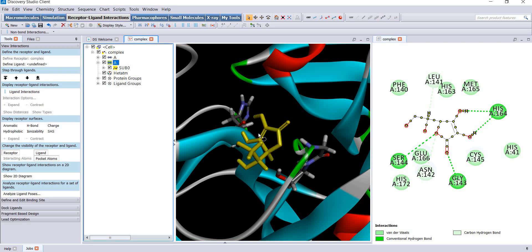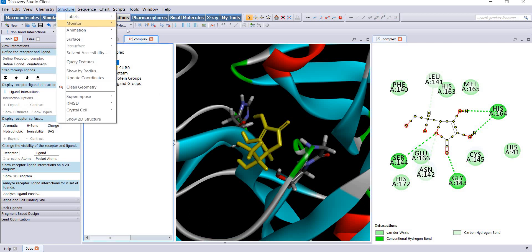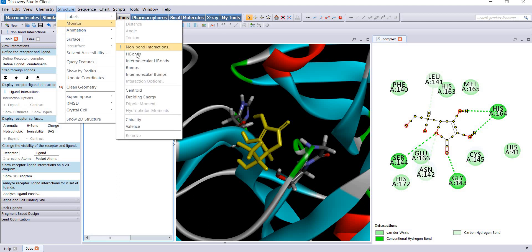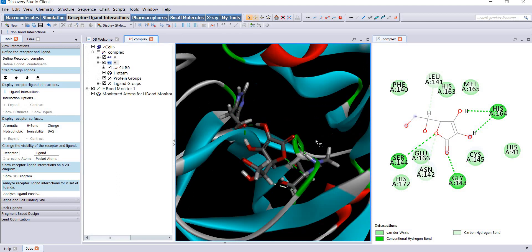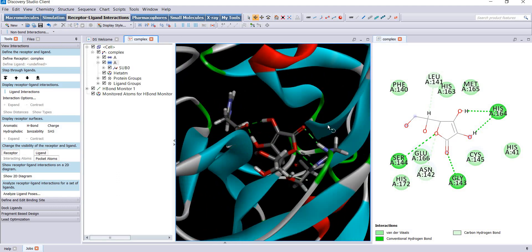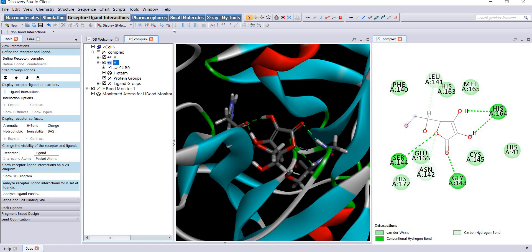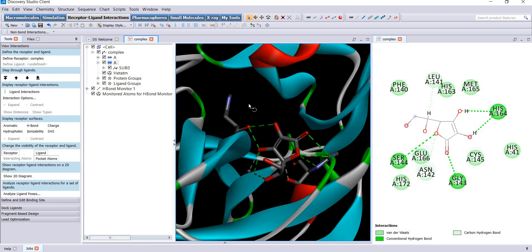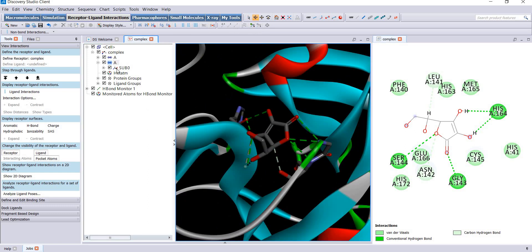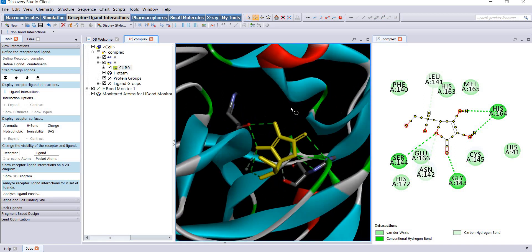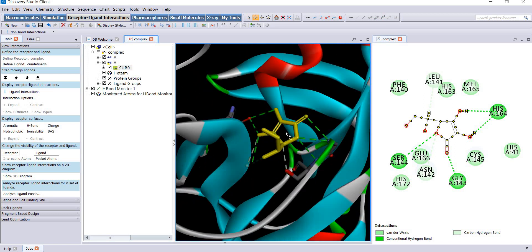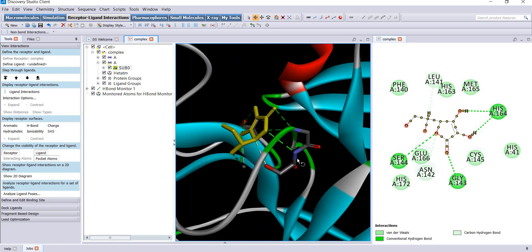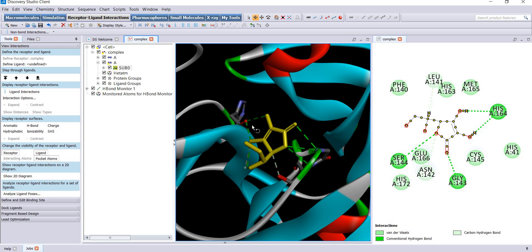I will select this ligand and go to structure, monitor, and hydrogen bonds. Now you can see the hydrogen bonds. I will hide the hydrogens for clarity. Now you can see this is your ligand and these are the hydrogen bond forming residues.